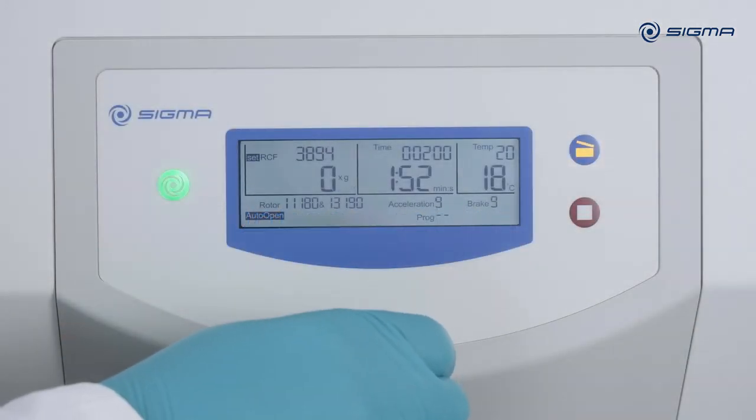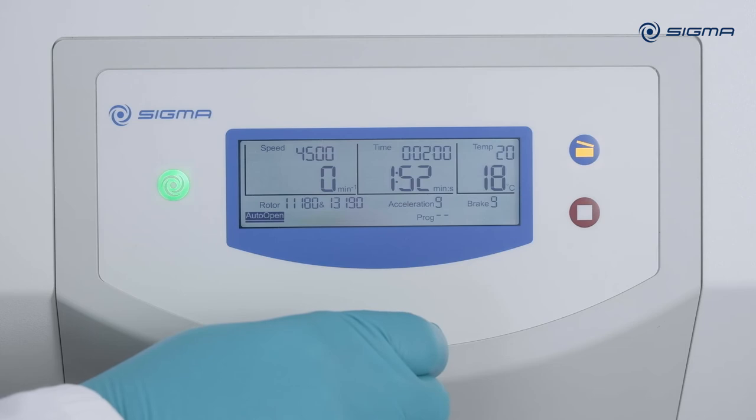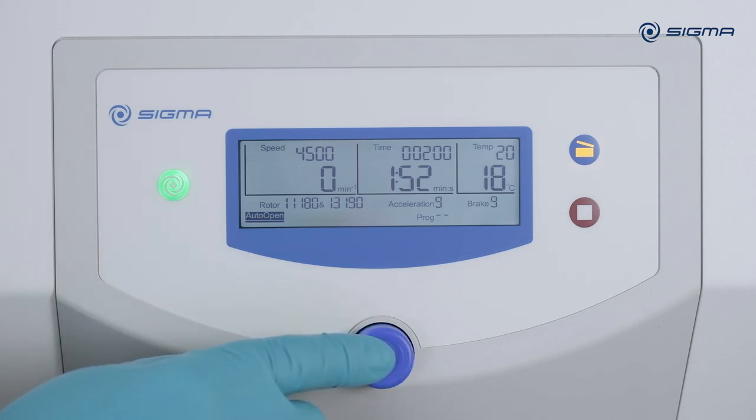Turn the knob multiple clicks to the right until you reach the bottom of the menu. There you can enable or disable automatic lid opening, the acoustical signal, and program blocking. To enable or disable an option, press the knob, turn it by one click, and then press it again.